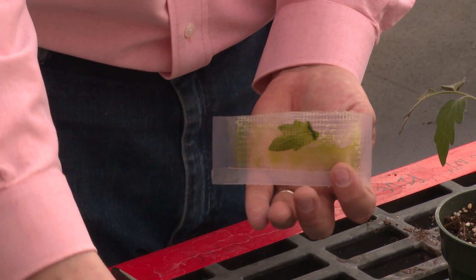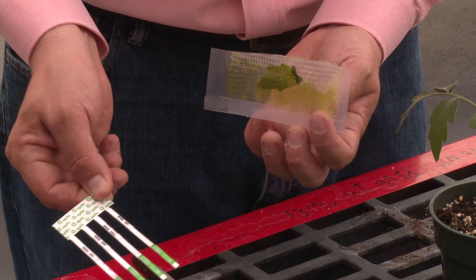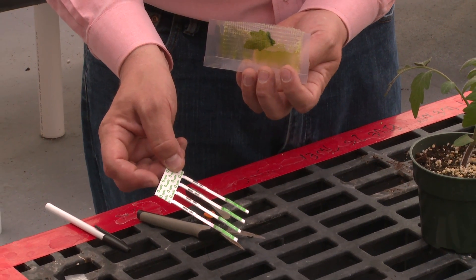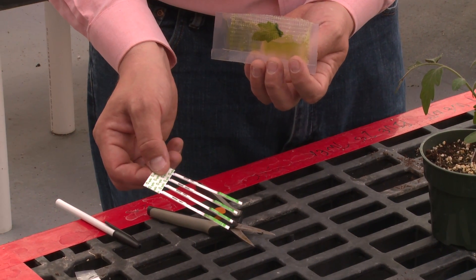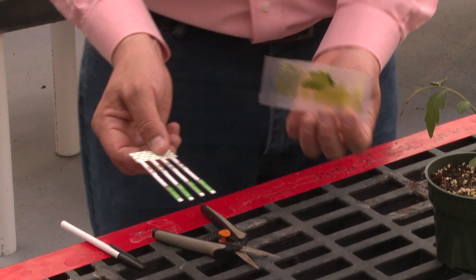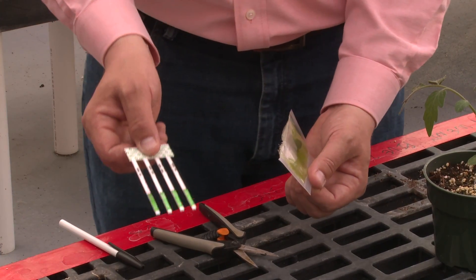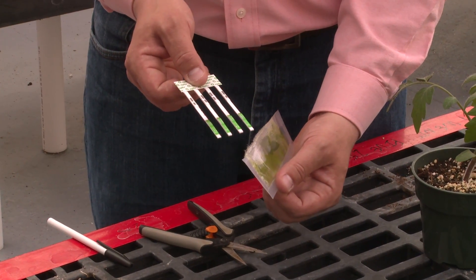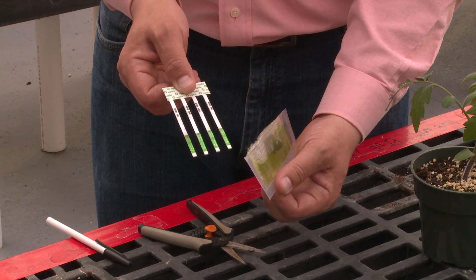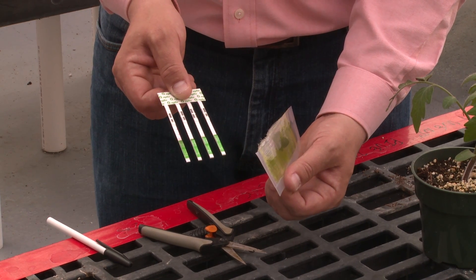We want to take our test strips that are going to help us identify the virus. Be careful to always handle these strips by the end that you're not going to dip into the solution. The next thing we want to do is dip these strips inside the solution. When placing the strips inside the solution, be careful not to place the strip any farther than the line that is indicated on the strip kit.